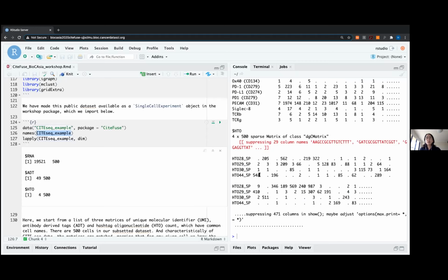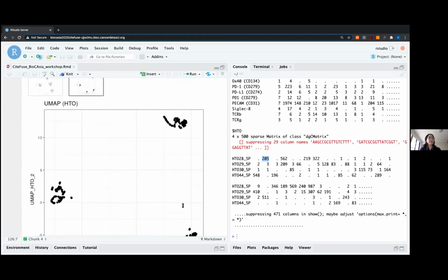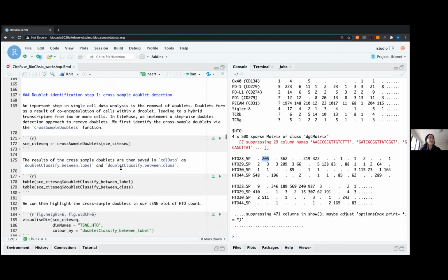So it becomes really clear when we look across by column that the first cell was a sample that originates from the 4th sample, and the second cell comes from the first sample. And going through the list, we can see which sample each of the cell originates from. So what we would expect is that a single cell should originate from 1 sample only, because they can't be found in both places at once, obviously.